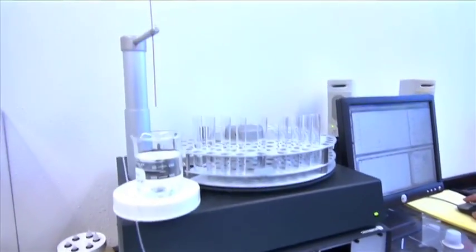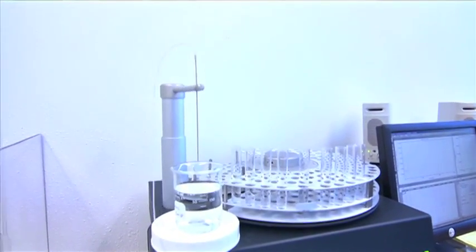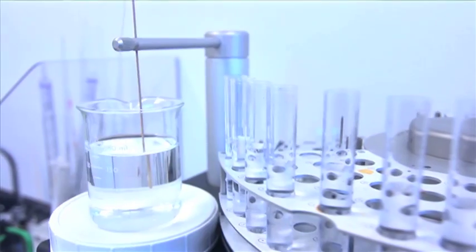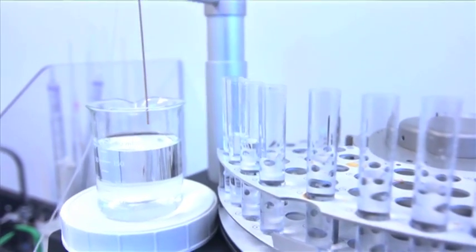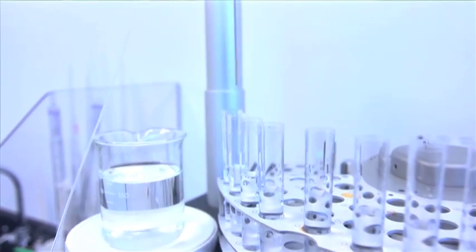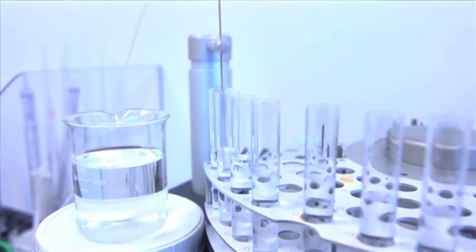80 tests are done every week for bacterial samples in the water system alone. In addition to that, there are other samples collected on both the surface water source and the groundwater source, depending on various schedules for different elements.